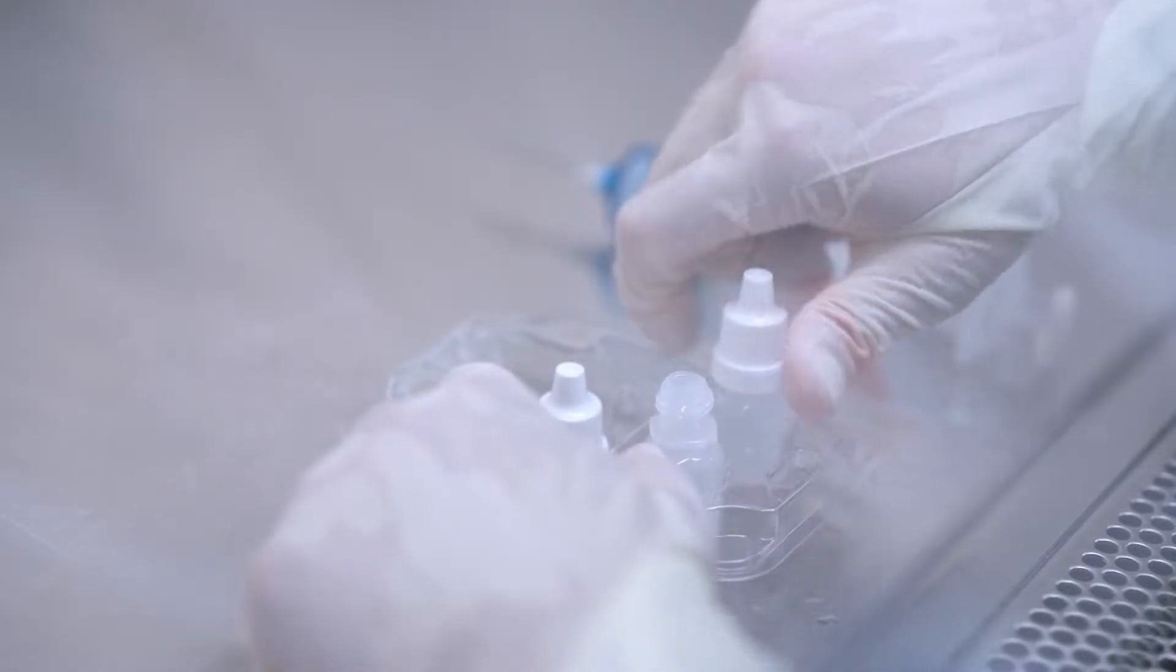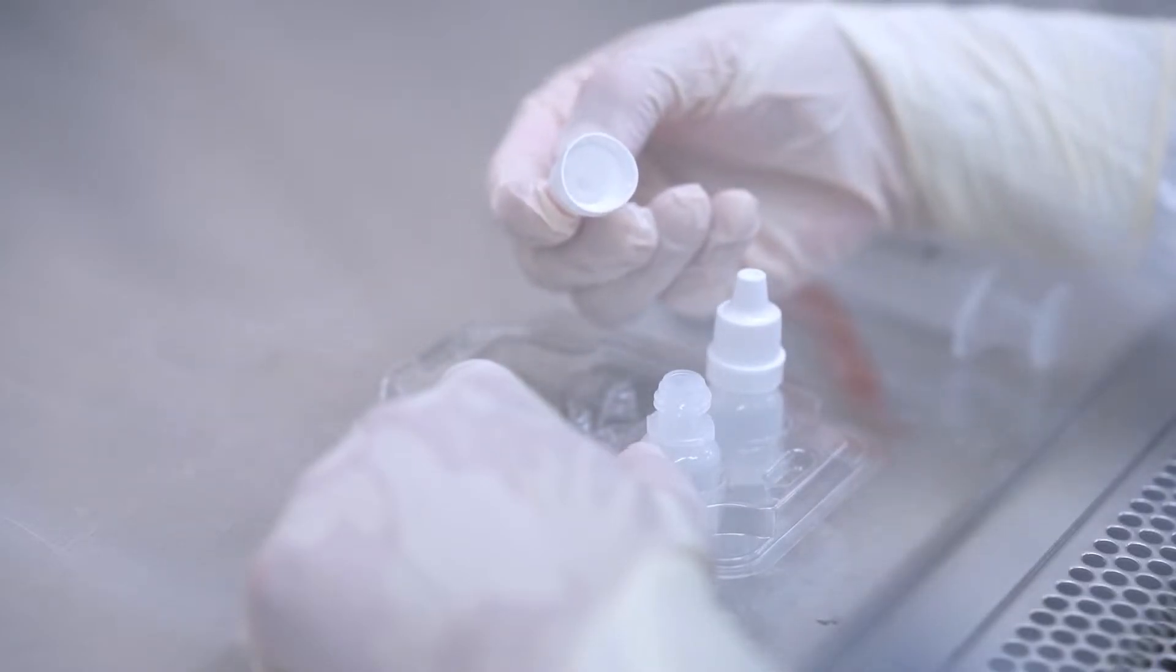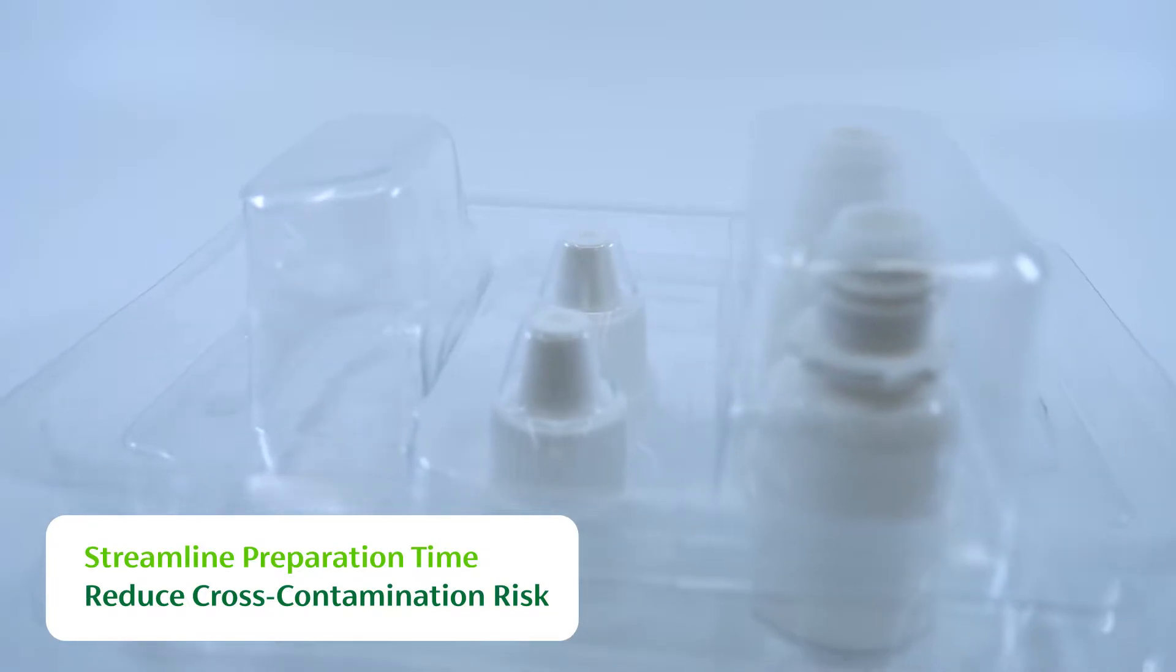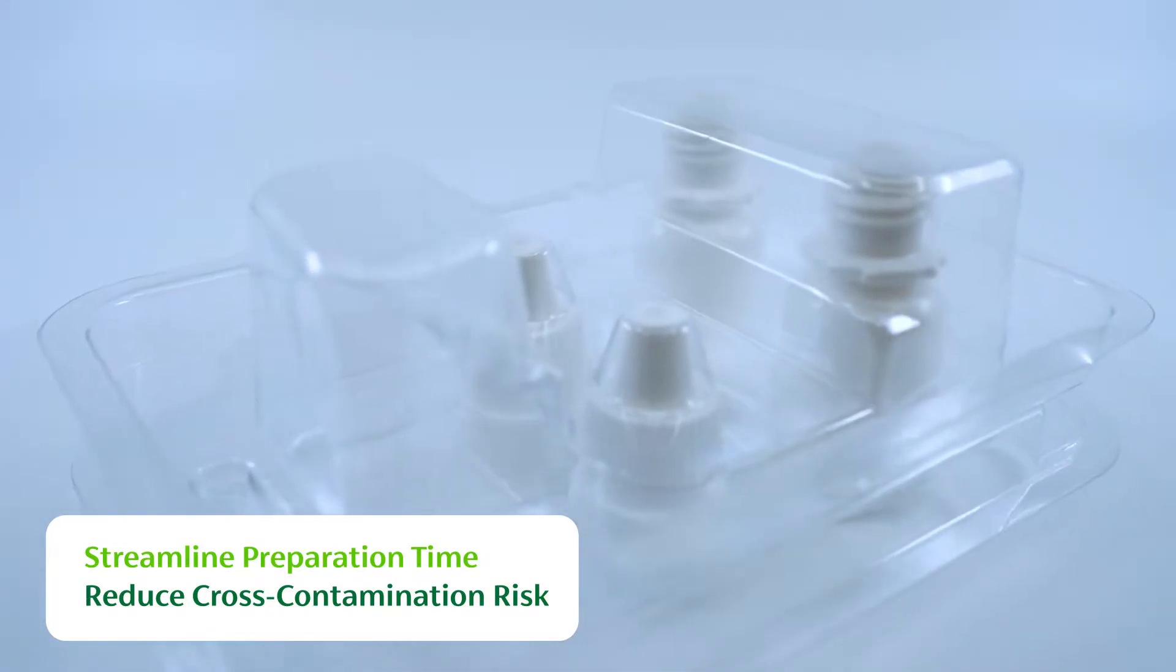In this video you will receive step-by-step guidance on the innovative features of this medical device designed to streamline compounded preparation time and reduce cross-contamination risk.